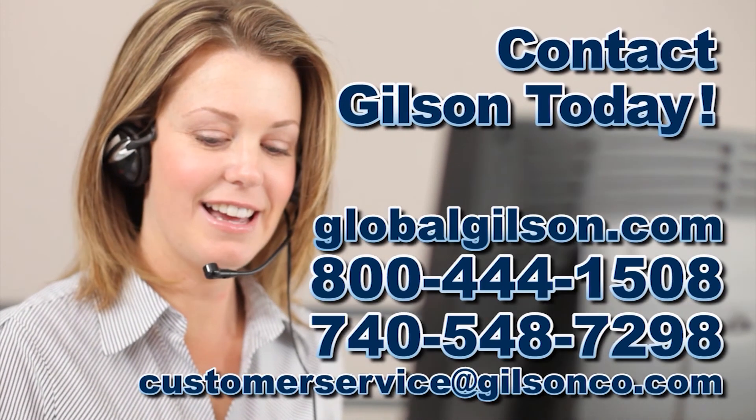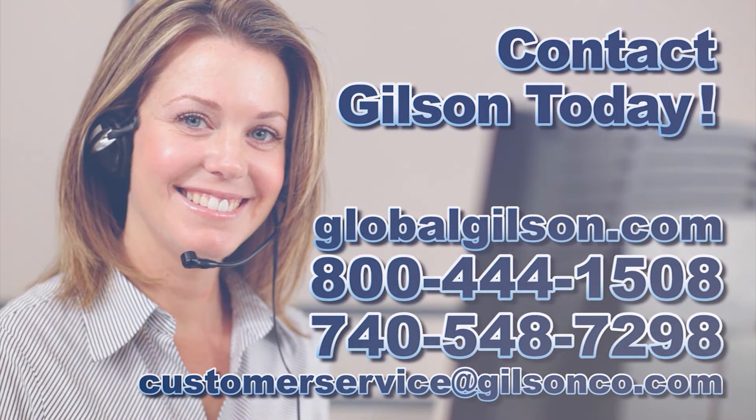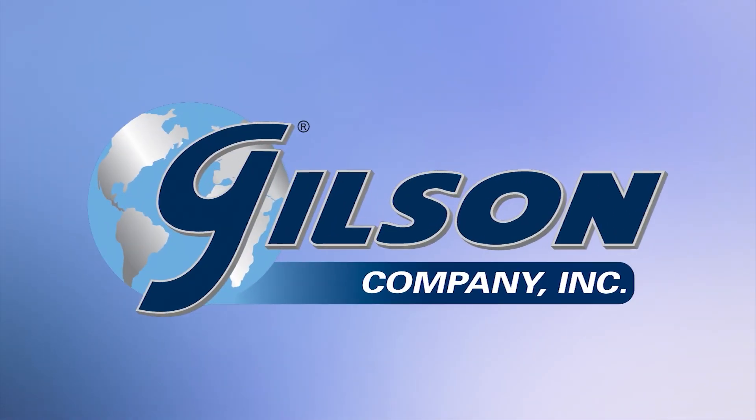For any questions concerning replacing the pump on your Gilson testing screen, or for any Gilson product, please contact your technical support team.